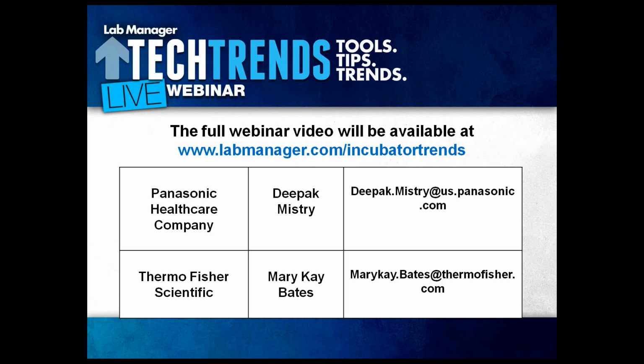So I think it's really good to take an in-depth look at what your environment is and what technology or combination of technologies are best suited to combat any type of proactive contamination event. No, absolutely. And I think this webinar is the first step towards that, comparing and contrasting different technologies and trying to figure out the one that works best for you.